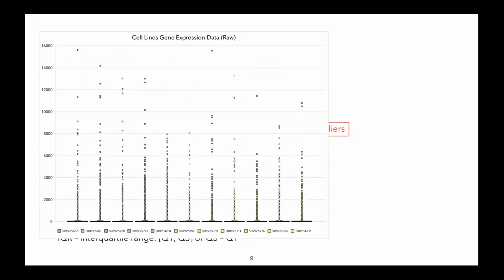If I plot the number of conditions here, and we see the expression raw reads, you can see the values that are below, and there is an expansion of values. So when you prepare a box plot, we can see the gene expression levels are heavily skewed in a linear scale.